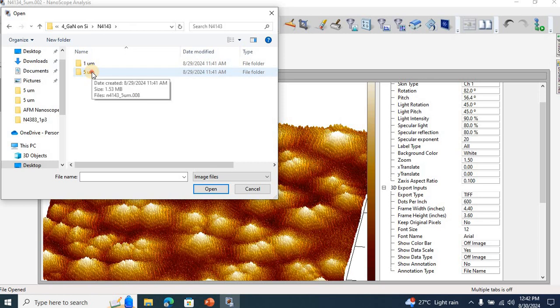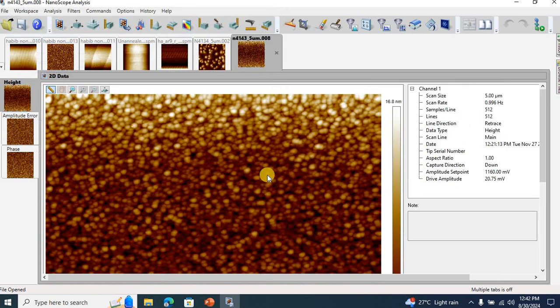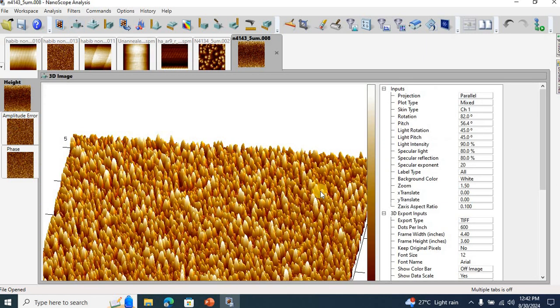And because of their thermal and lattice mismatch, you will not see high quality films for gallium nitride grown on silicon substrates. It results in a three-dimensional growth, as is visible over here in this scenario as well.